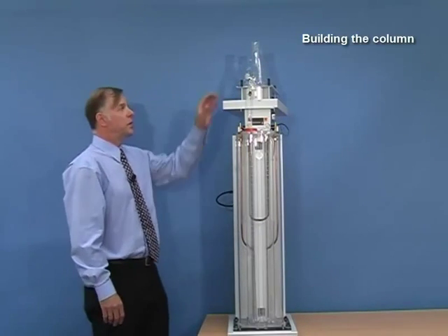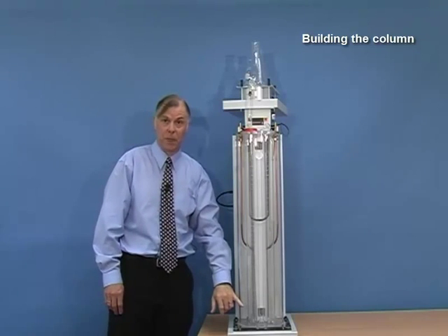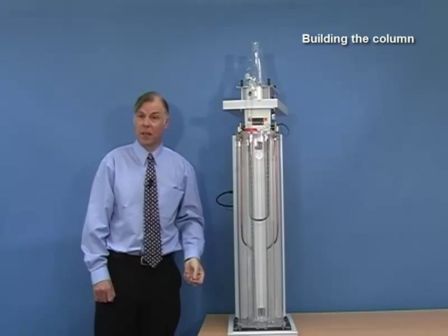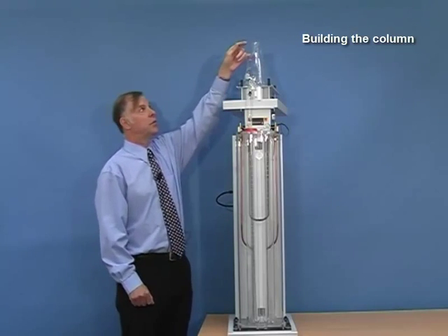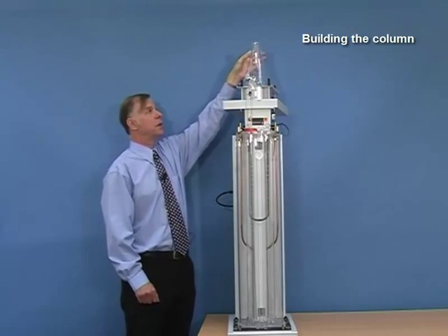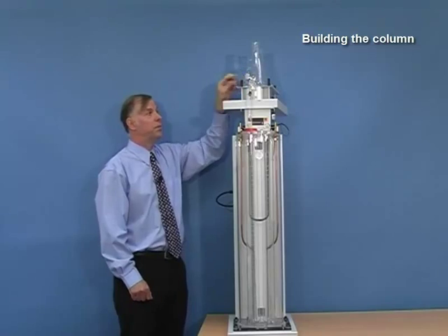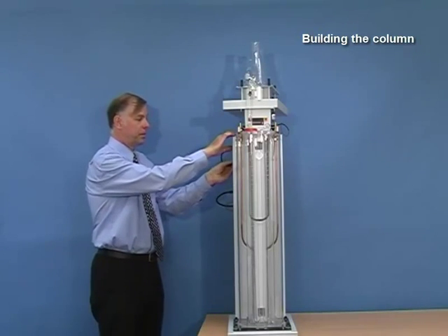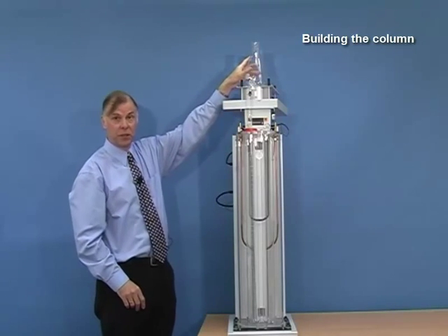Now that the unit is assembled, we need to build the column. Supposing I need a range of densities from 0.9 at the top to 0.95 at the base — I will need two liquids: one very slightly less than 0.9, for example 0.89, and the other very slightly greater than 0.95, for example 0.96. I will mix up a litre of each, add 860 millilitres of the low density liquid (0.89) into the front flask and 860 millilitres of the heavy fluid (0.96) into the rear flask. Open the tap between the two, allow the liquids to stabilise, then connect the stirrer to the mains — the magnetic stirrer will start spinning inside the front flask which contains the light fluid.